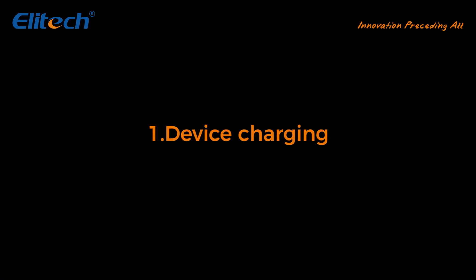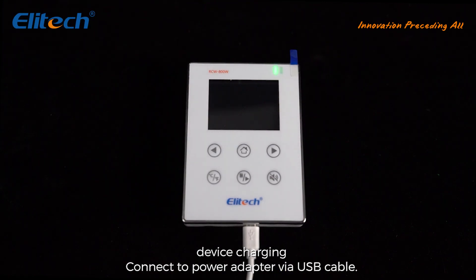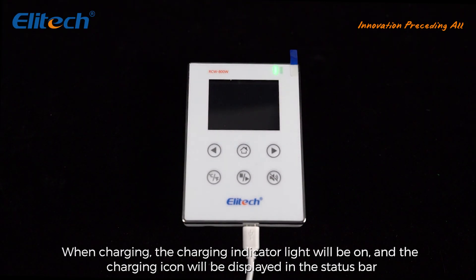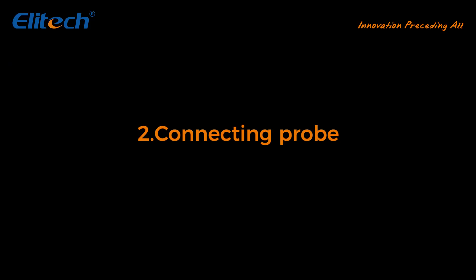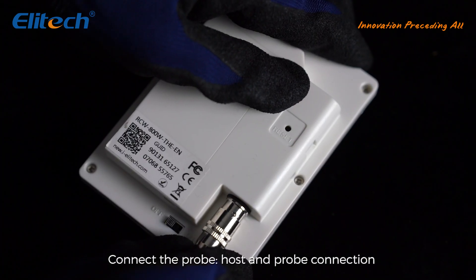Device charging: connect to the power adapter by USB cable. When charging, the charging indicator light will be on and the charging icon will be displayed in the status bar. Connecting probe: connect the probe host and probe connection port.